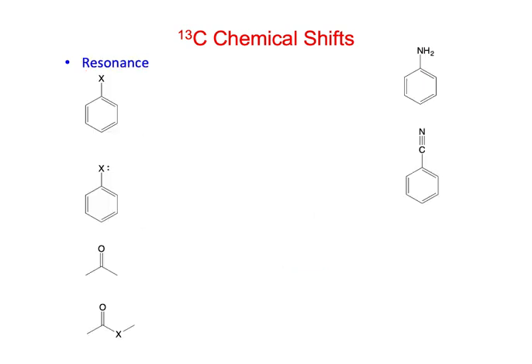All right, so here are a few more examples that can influence it. Resonance and electronegative groups can influence it. So let's say that this first X is an electron withdrawing group. The most common of these would have some kind of fluoride or iodine. Those would be electronegative, but iodine isn't going to be so involved in resonance.